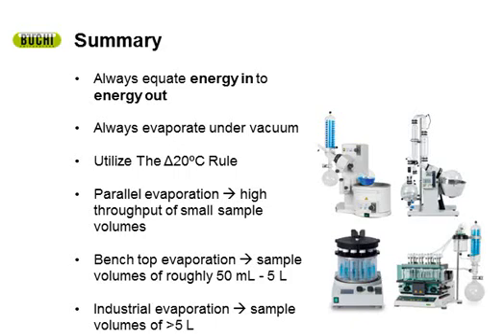Next one is, what is the importance of evaporating under vacuum? A, evaporate at a lower, more gentle temperature. B, increase analyte yield. C, automate the process. D, all of the above.